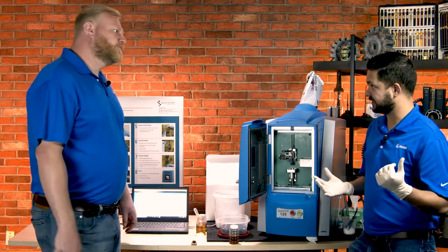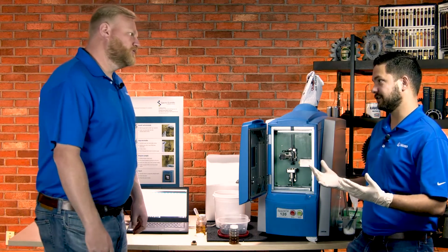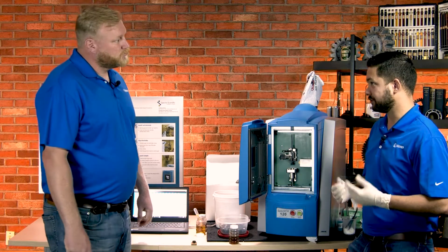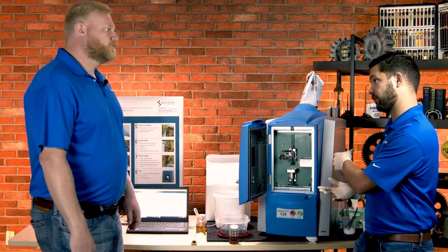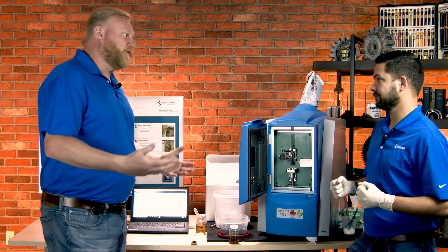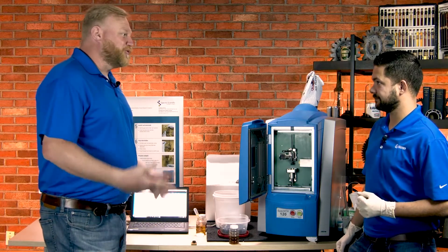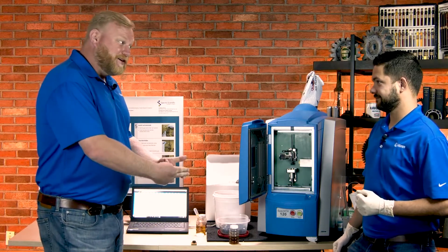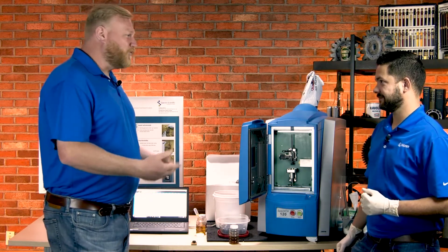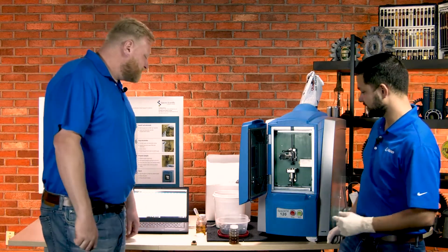I was at a customer site just yesterday and they were dealing with a bearing failure. We took the opportunity to take an oil sample and do some analysis — one of the key things being the elemental data. We want to take advantage of it when it happens to be able to reduce it in the future. Oil analysis can be predictive and proactive, but sometimes we deal with the post mortem and do root cause analysis to see how it happened and how we can avoid it.